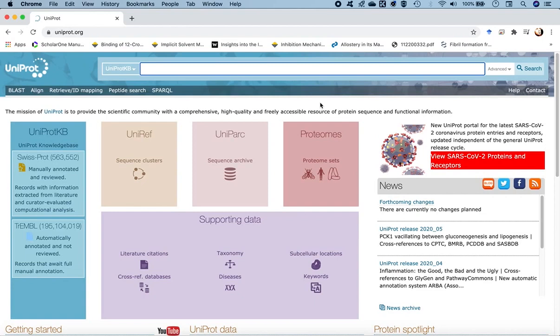But LAG3 has a sequence homology of around 20 to 25% with CD4 and IL-2, which are immune responders in the body. So it's responsible for T cell immunology. These are also glycoproteins, and they have a specific topography in their structure with specific domains, especially four extracellular domains, which are separated by loop regions. So we are expecting that LAG3 would also have a similar structure. But we can't do the homology modeling because the sequence identity is less than 30%.